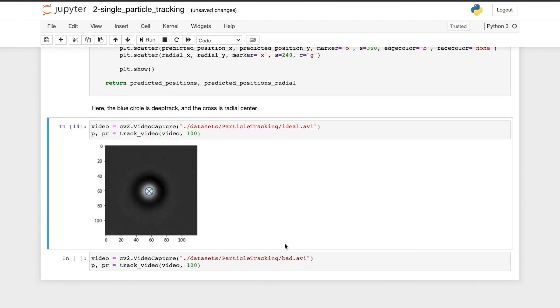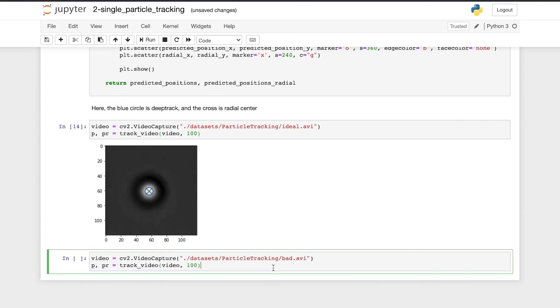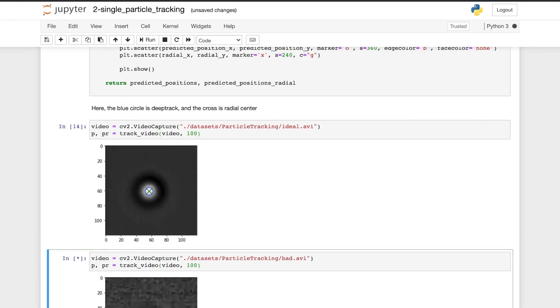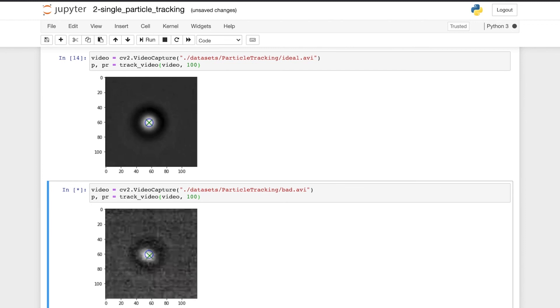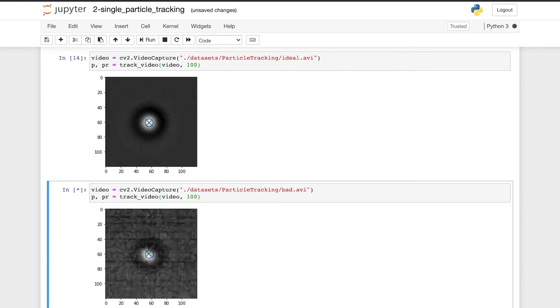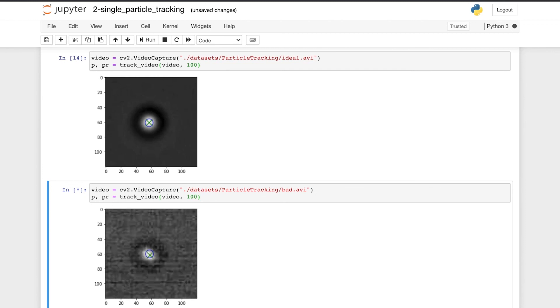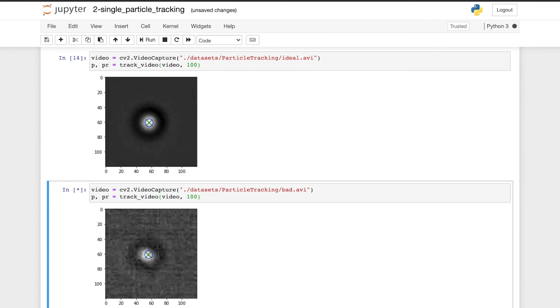The second video is of the same optically tracked particle but now in bad imaging conditions. And here we see that DeepTrack is still able to track the particle quite well, but the other method not so well.